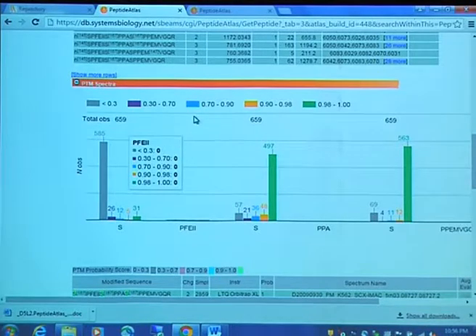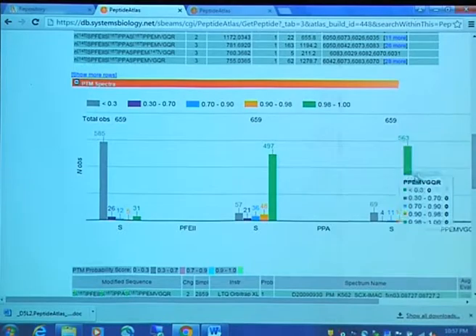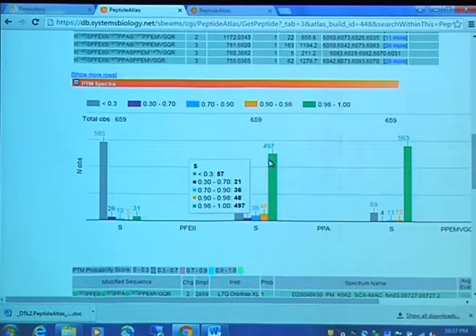Now this peptide has been seen with a single phosphorylation. So how do we know there's been a single phosphorylation? If the mass of the precursor ion varies from the mass of the sequence without a phosphorylation by 79 point whatever Daltons, that means there's a single phosphorylation. If it varies by about 160, then that means there were potentially 2 phosphorylations. So you can see that this represents the confidence that this particular amino acid was seen.